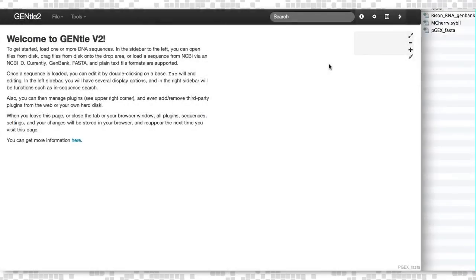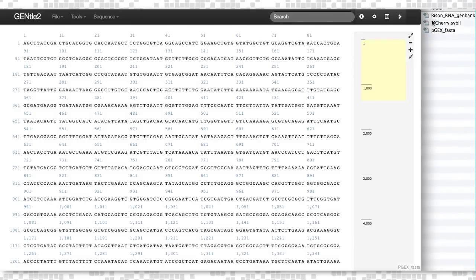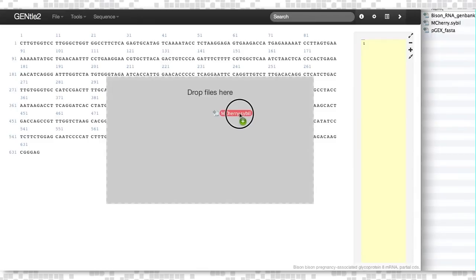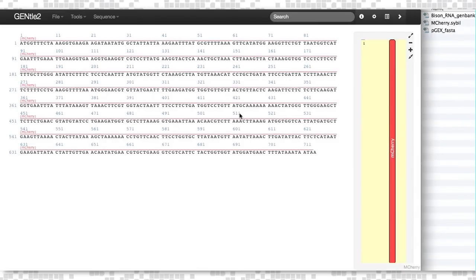DNA can be loaded into Gentile using many different methods. You can drag and drop various file types including FASTA, GenBank, and even SYBIL files, which is the Synthetic Biology Interchange Language.